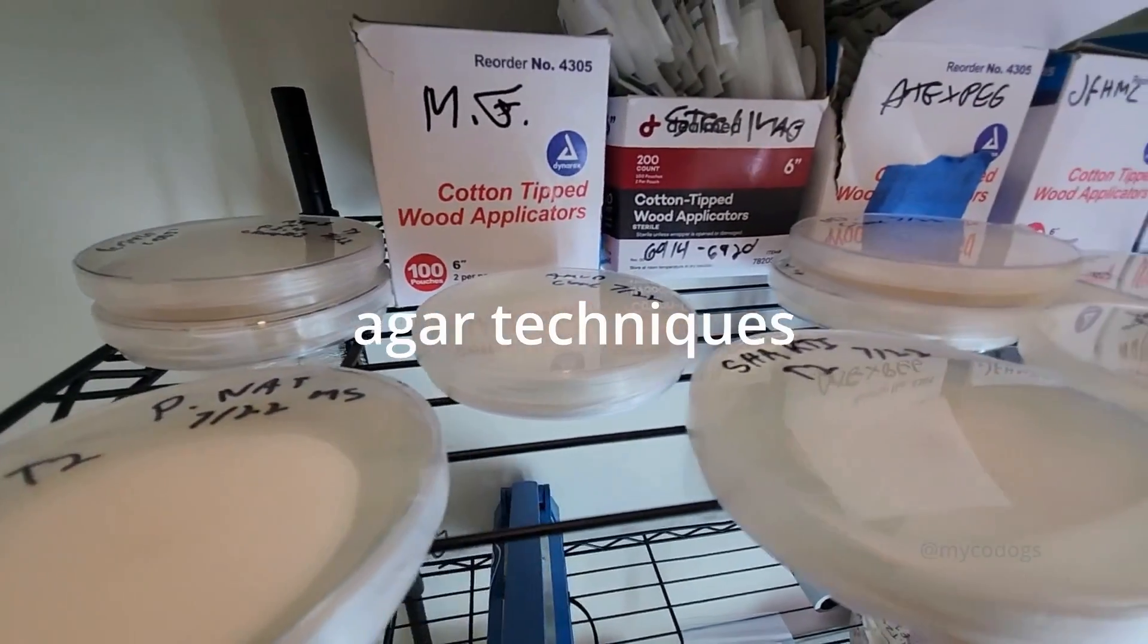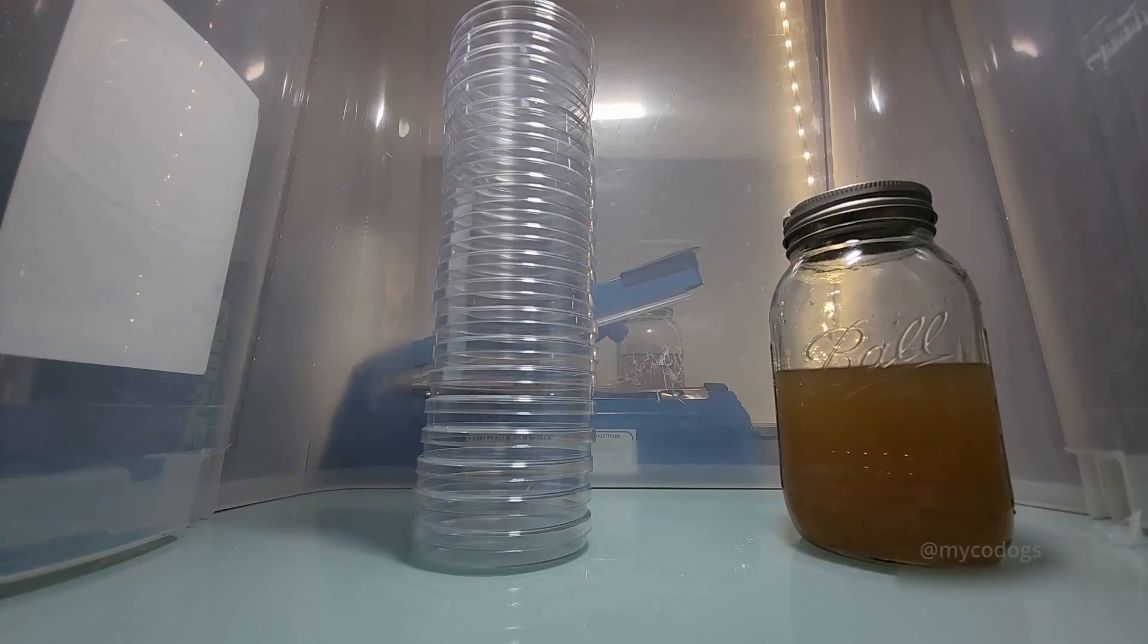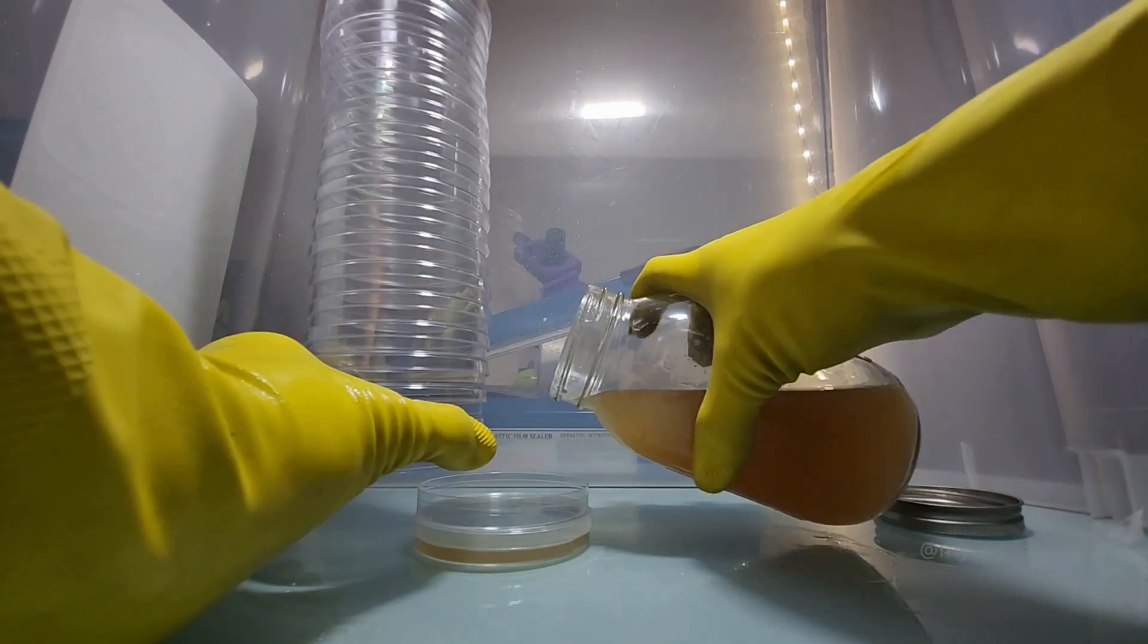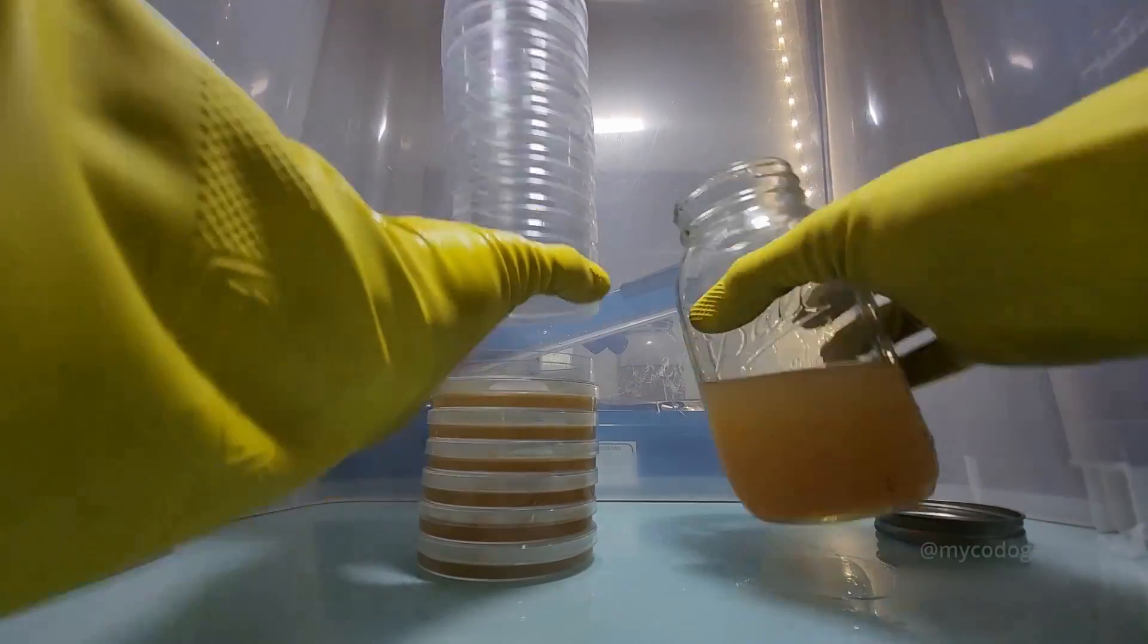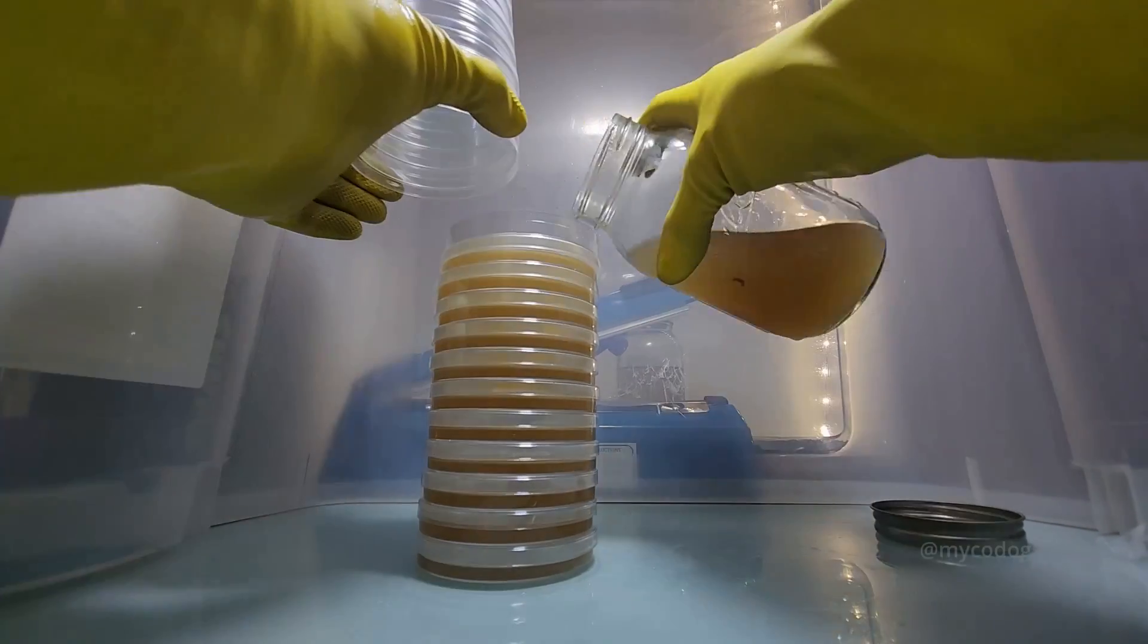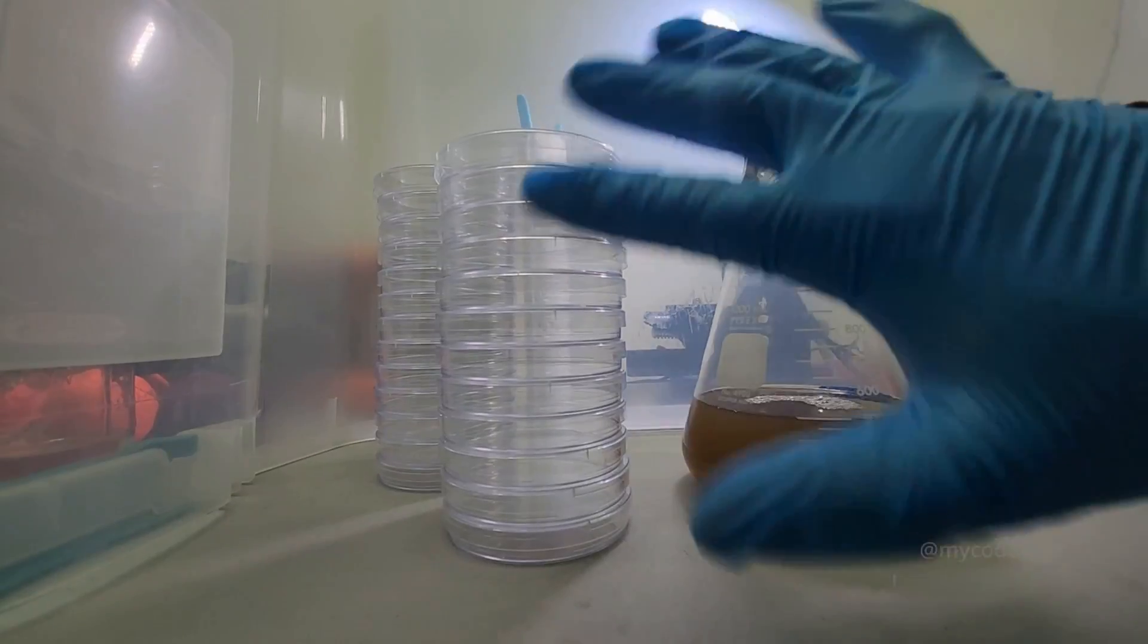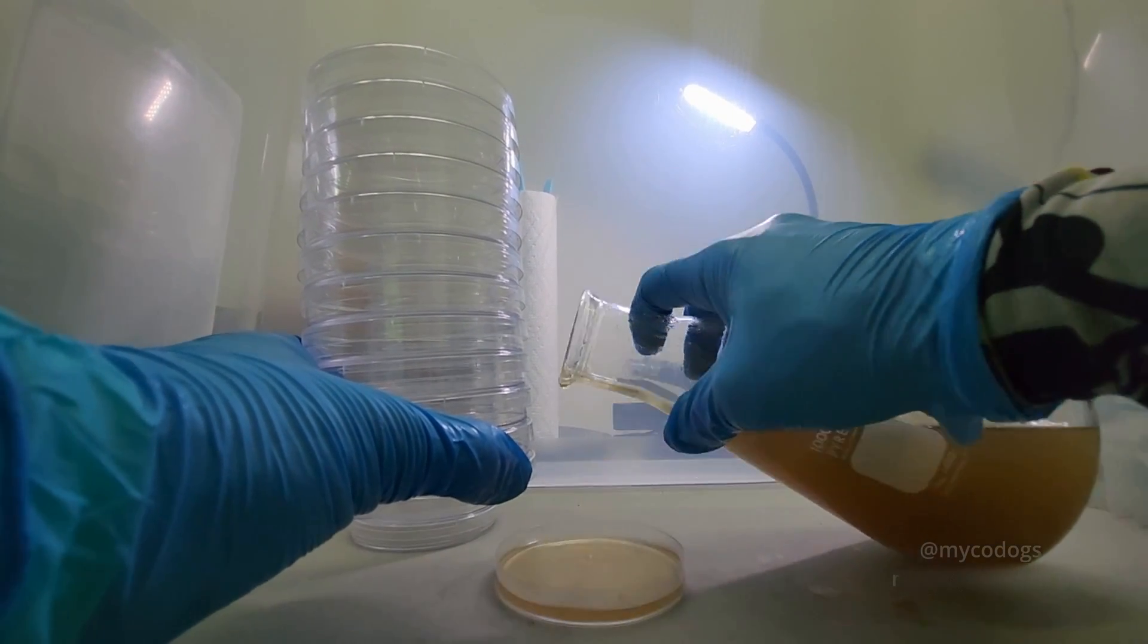I'd like to go over some more specialized techniques when working with agar starting with pouring the plates. When you pour the plates it's good to allow the media to cool down inside of the still air box. This serves two purposes. This allows the media bottle to cool in a sanitary location which helps prevent contamination from ingress of surrounding air due to vacuum formation. It's good to pour consistently and quickly. You don't want to be hovering over the dish for a long time or opening and closing it. As I mentioned earlier, a taller still air box makes pouring the agar hundreds of times easier.